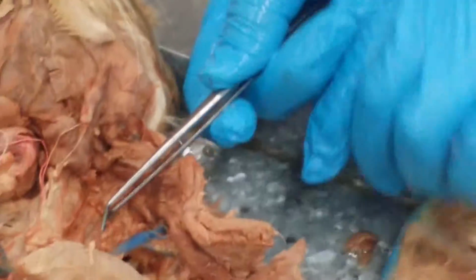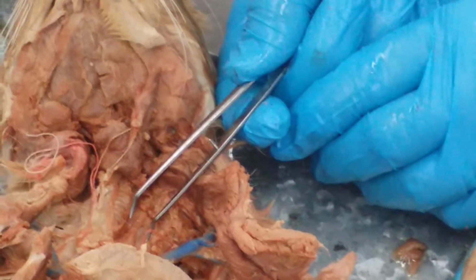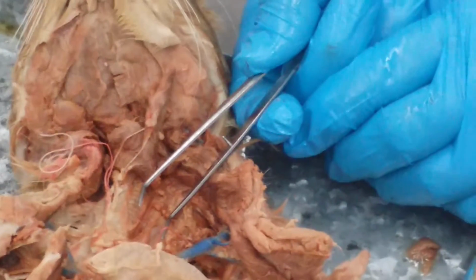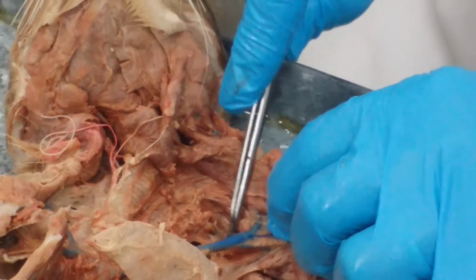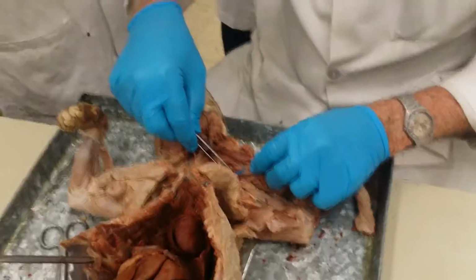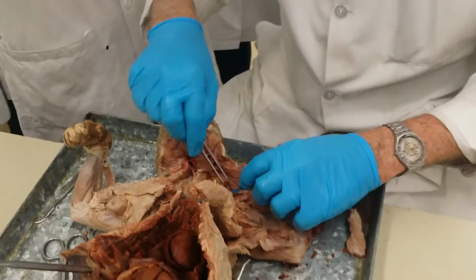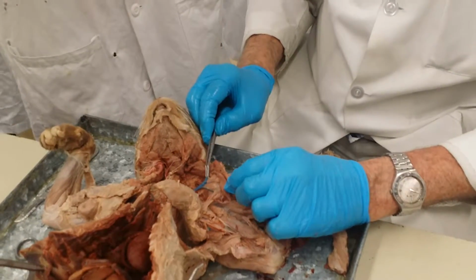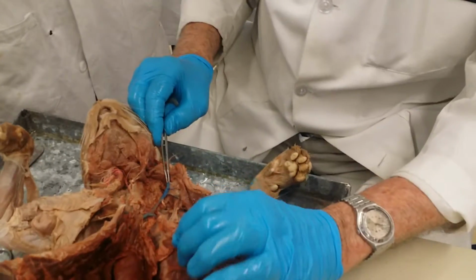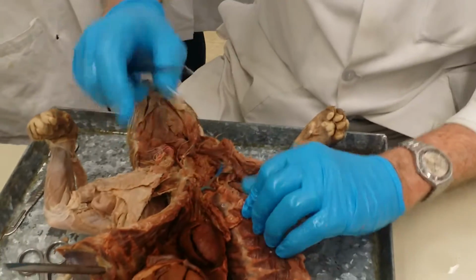This is the vessel known as the thyrocervical, in the neck. And the transverse scapular artery comes off of that vessel and parallels the transverse scapular vein. This is the external jugular here. All right? Now, arterial system.